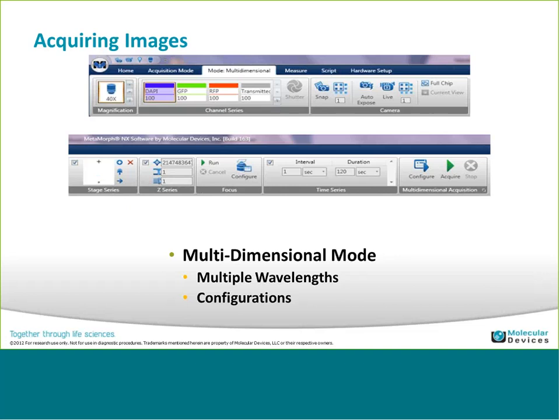It then propagates the fields here of the midpoint, the range, and the step size. So you have to run the script first before you do the actual acquisition, but you can configure top and bottom position values through the script.